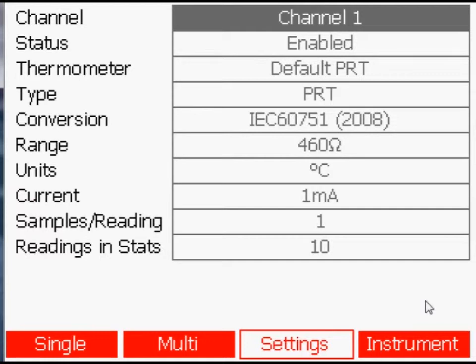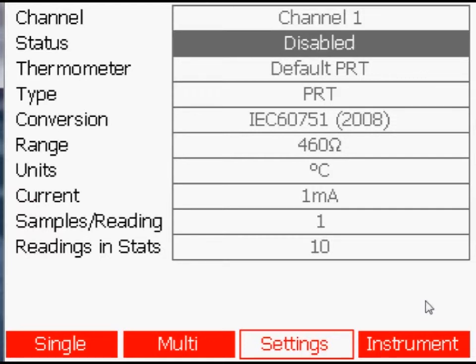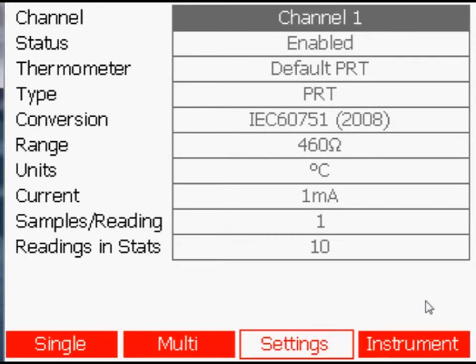If a channel is not being used, it is best to change its status to disabled. This will then make the measurement time available to enabled channels, which will speed up these measurements.